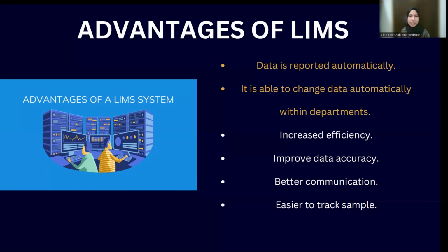Since all the data and all the information are stored in one place, which is inside the LIMS itself, it is easier to share the information to the other members in your team. So by this as well, miscommunication won't happen because all the information that everyone got is the same, because it is based in the LIMS.